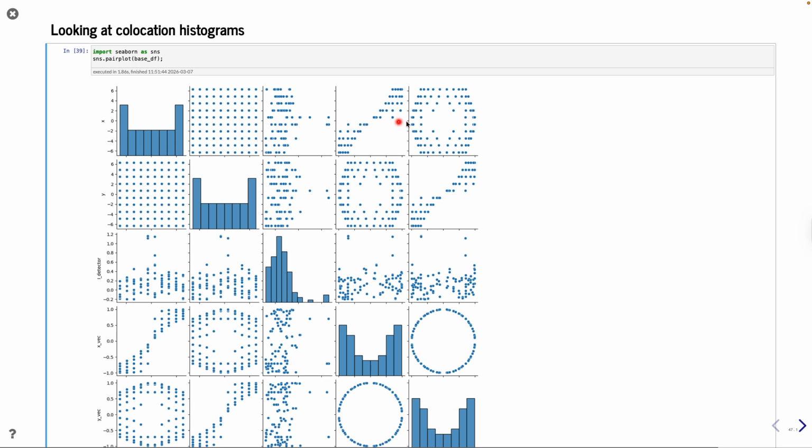And then you see different combinations. The fun thing is that if you look at two vectors against each other, you can see that they actually plot a circle. In some cases, you can see nice trends if you do this kind of plot. Other cases require some interpretation. But as an overview, this kind of plot can be helpful if you have multidimensional data.